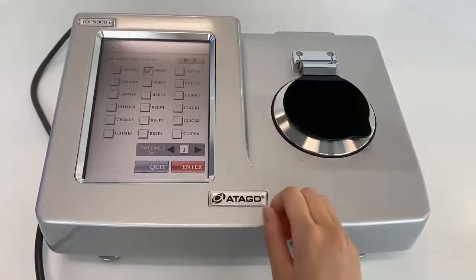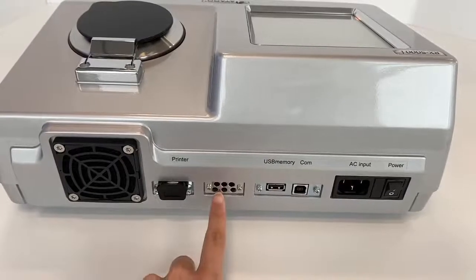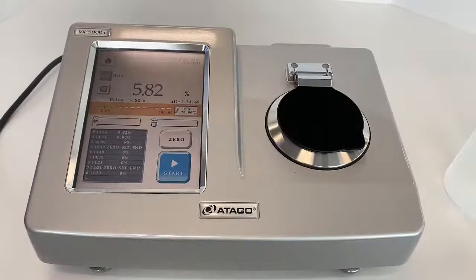A quick note: you can also change the sound on RxI. RxI has USB ports for USB memory and a printer. I also want to mention that with RxI, you can see the Brix value and refractive index value on the same screen simultaneously. With Rxα, you had to click the button to switch to see the refractive index, but with RxI, both values are visible on the same screen.